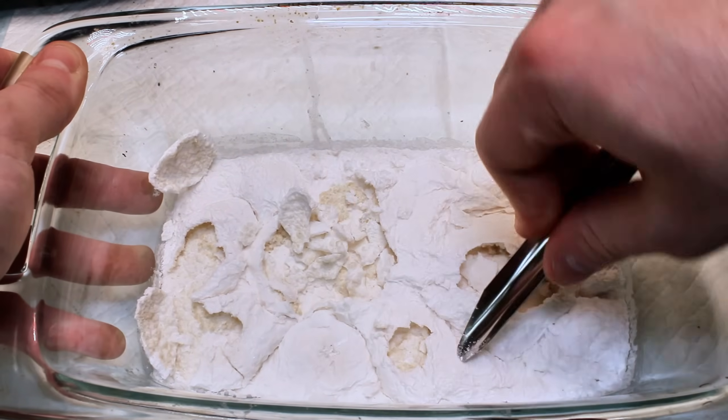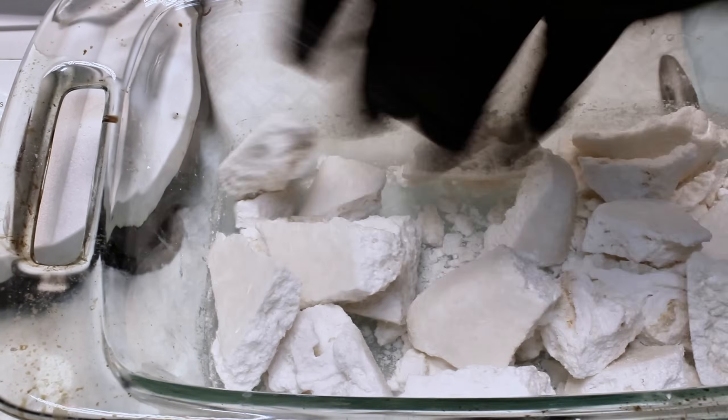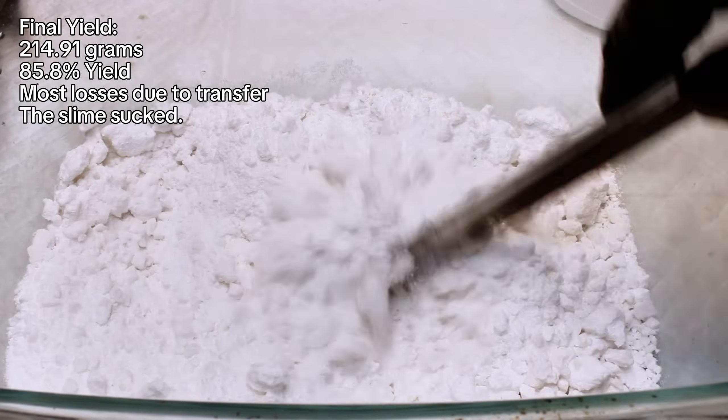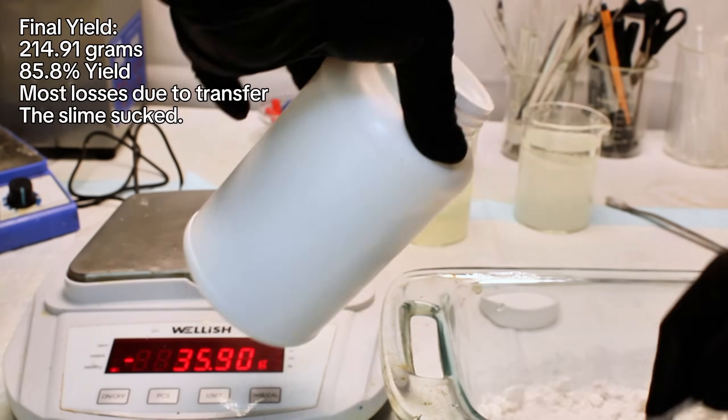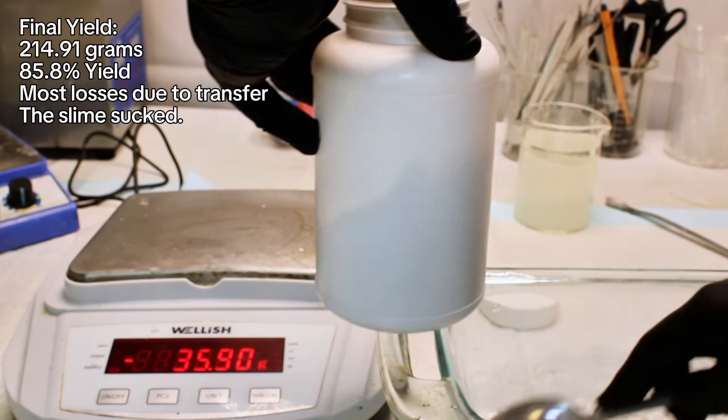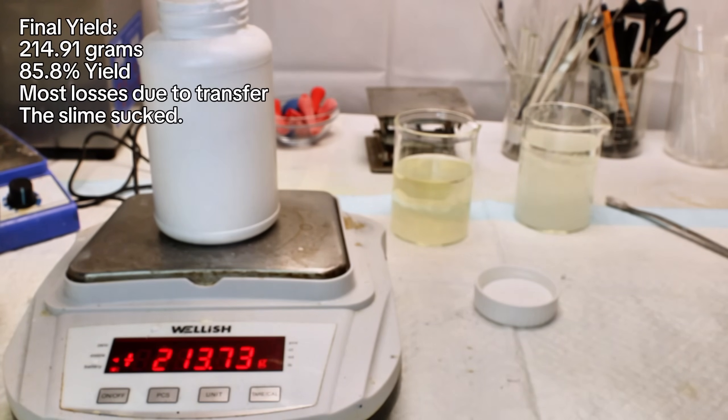The resulting slab of calcium nitrate was broken apart, powdered, and weighed for a final mass of 214.91 grams representing an 85.8% yield, with most of the 14.2% loss being in transferring the calcium nitrate between containers.